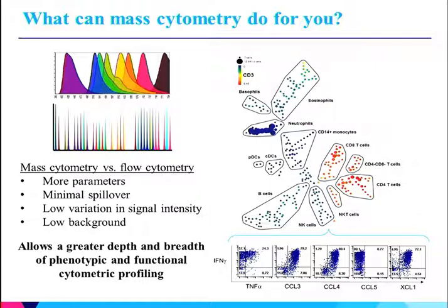So I'm actually going to take a much more basic approach for most of this talk, and instead focus on what are some of the initial steps that have to be taken to be able to actually establish a facility that is able to generate this sort of data.